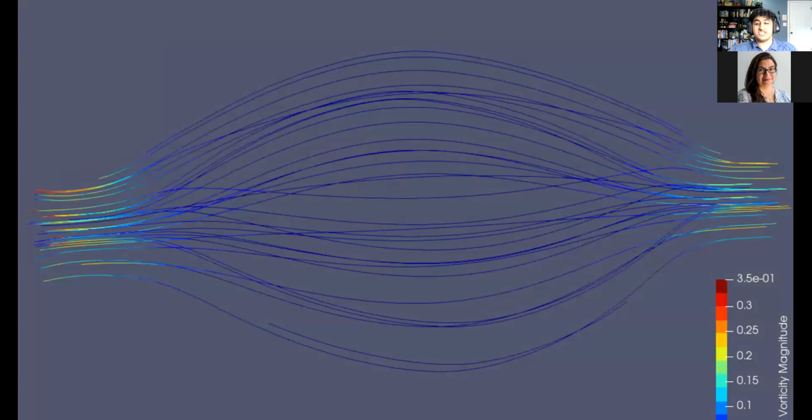But how do we decide the shape of the chamber? How do we decide the rate of fluid flow? Well, first, we can use fluid simulations, and we can generate this diagram. And in this diagram, you can essentially see the different paths a fluid can take in our bottom chamber. And these simulations are important because the vascular cells we're using in a co-culture can be damaged by the media's vorticity and velocity.